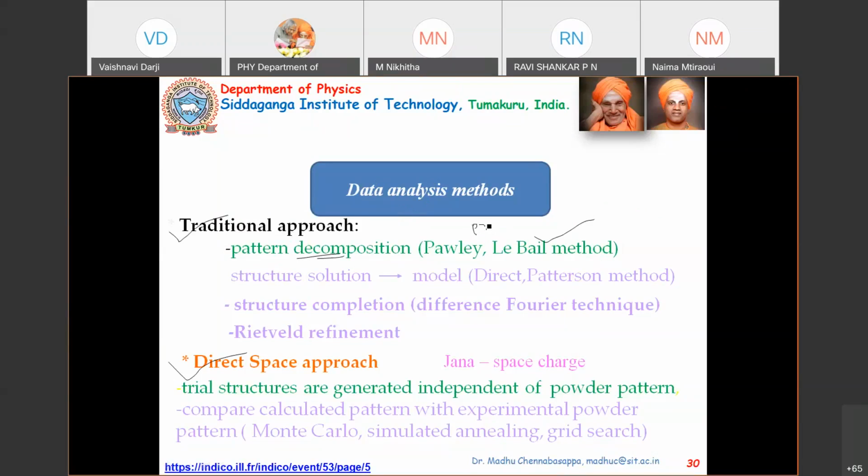So we are going to learn this profile matching. Profile matching is where you take your data and try to match it with already known data. Okay, so this is your profile matching. This is your first approach.